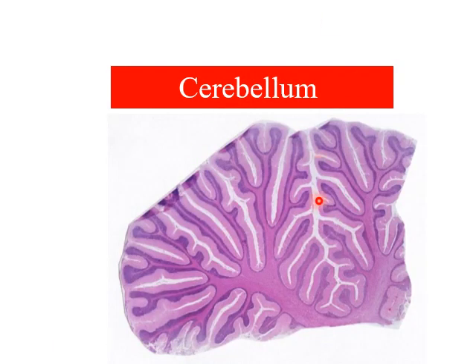The last slide here, dear students, is the cerebellum. You can see the folded surface. Each fold or folium is formed of outer dark gray matter, and inner pale medulla. The outer dark gray matter, here is the dark part, which is the granular layer of the cortex.